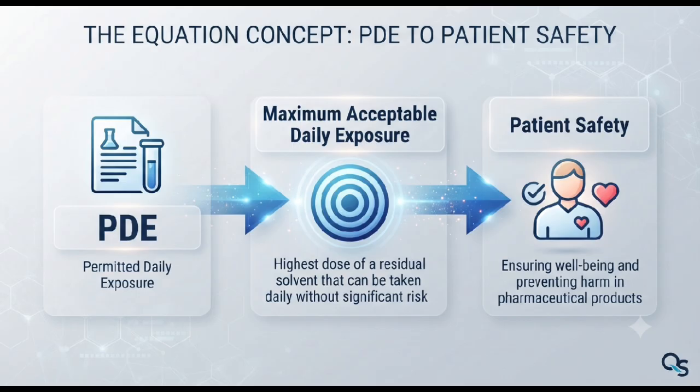PDE, permitted daily exposure. An important concept in residual solvent control is permitted daily exposure, commonly abbreviated as PDE.